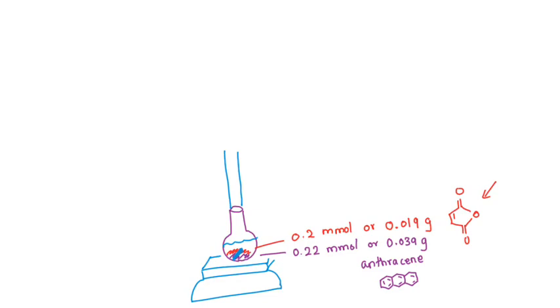The hot plate we have in our lab will have a heating setting and a stirring setting. So it's a hot plate as well as a stirrer. We're going to heat up to 137 to 140 degrees centigrade. At that temperature, your solvent will evaporate. Our aim is not to evaporate the solvent. If you evaporate solvent, your product will be turned black and charred.